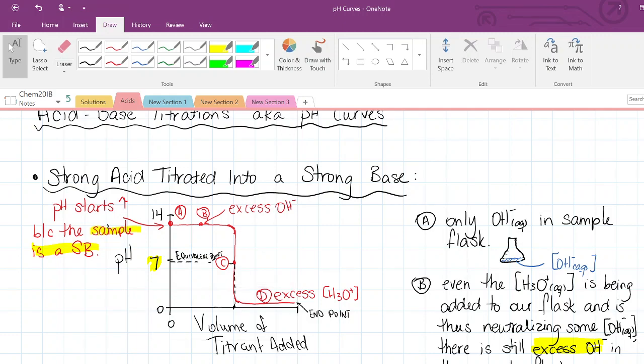In a pH curve, generally if our goal is to generate a full, complete pH curve, then at that point I'll keep going past the equivalence point until I don't see a change in pH anymore. And for me here, this is my endpoint right here, because that's where I'm stopping my titration.